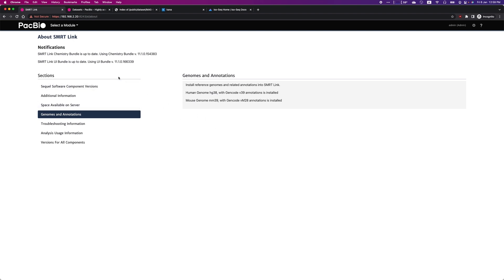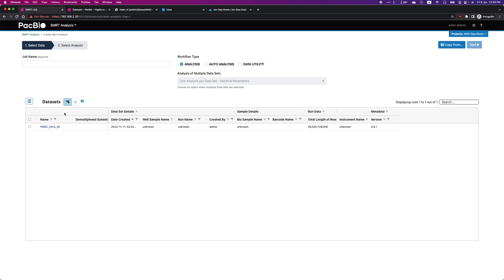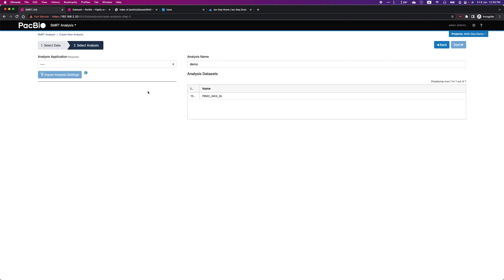After the download is complete, running an analysis is as easy as navigating to Smart Analysis, create a new job, select the imported dataset, give it an analysis name, click Next.